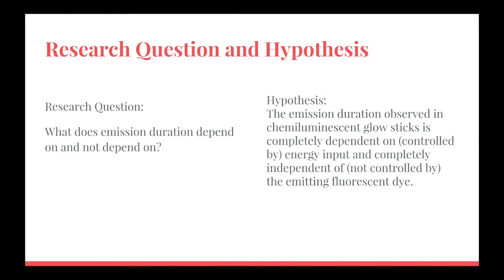The research question presented to us was, what does emission duration depend on and not depend on? The hypothesis given is that the emission duration observed in chemiluminescent glow sticks is completely dependent on the energy input and completely independent of the emitting fluorescent dye. Let's find out if this is true.